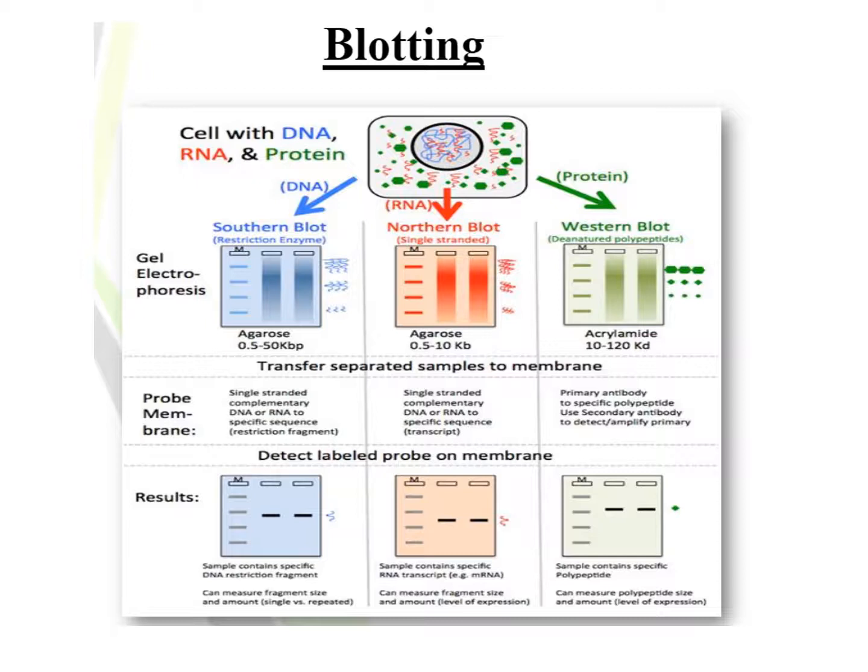So now we're doing the Western blot, and we have to have some type of primary antibody to some protein. If we're interested, what's this spot? And we have the secondary antibody that has to detect and amplify the signal. And these can be different samples. Say that's cancer and wild type, and is the protein in one but not the other, and contains specific protein.